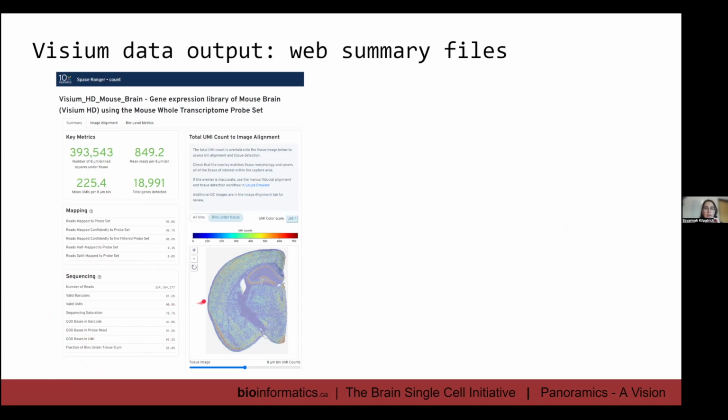And to the right, I just want to highlight the utility of using spatial at the very beginning just to examine your QC. Shown here is the number of unique molecular identifiers, or UMIs, across your tissue section. And it can give you a sense of how clustered your cells are together or how deeply sequenced a region is. And it can also indicate if there's any aberrant debris or detection of signal outside of your tissue.